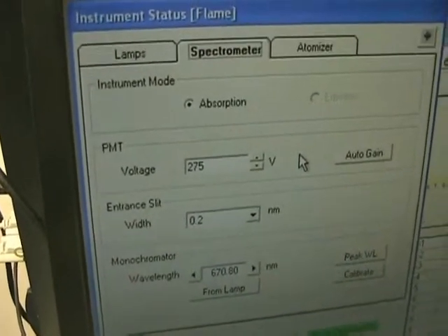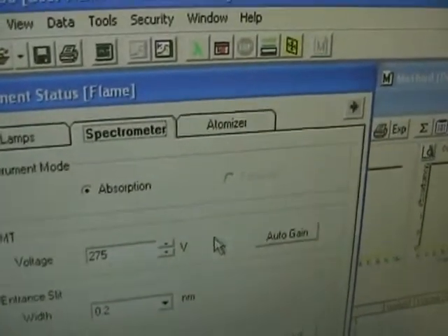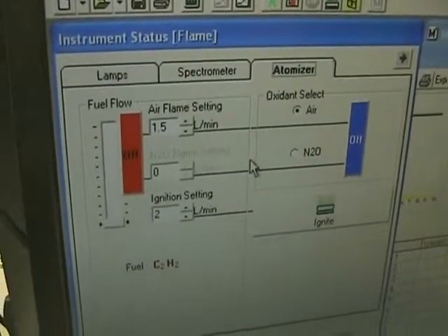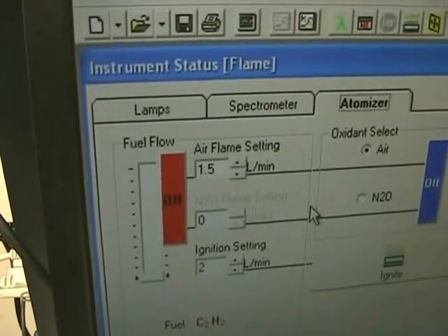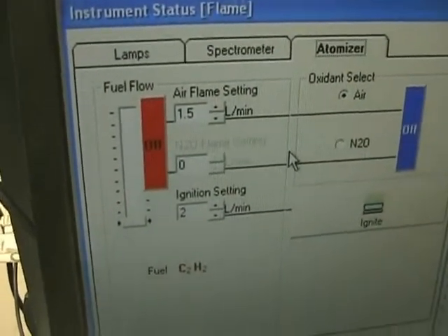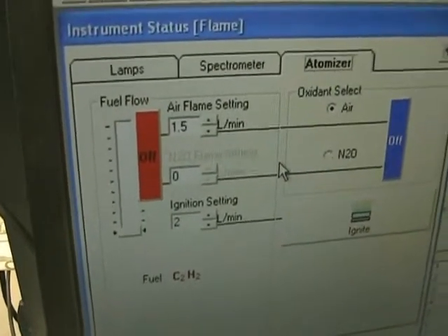It just takes a little bit of playing with and you can get it up and running without any problem. Back over on the atomizer tab, we have the actual flame settings — you can see we're using the air flame setting at 1.5 on top, and the ignition setting set to 2 on the bottom, which is usually about what is required.